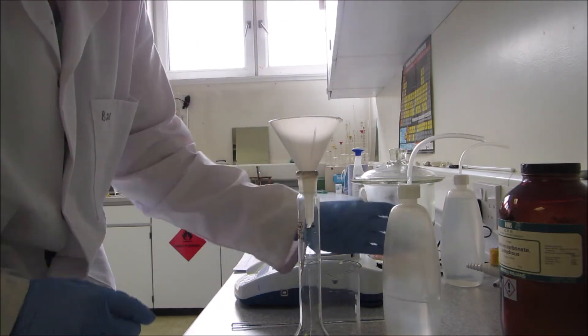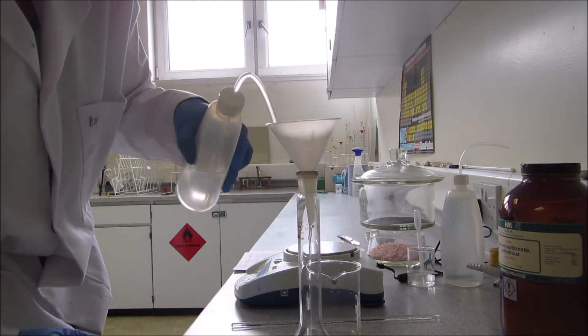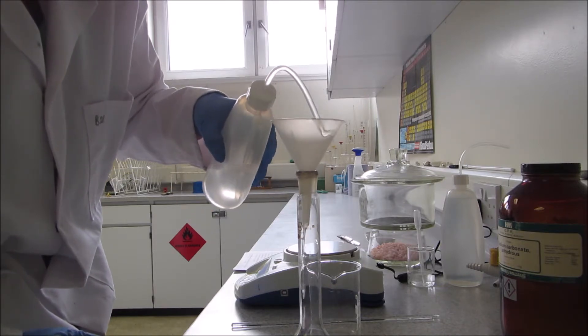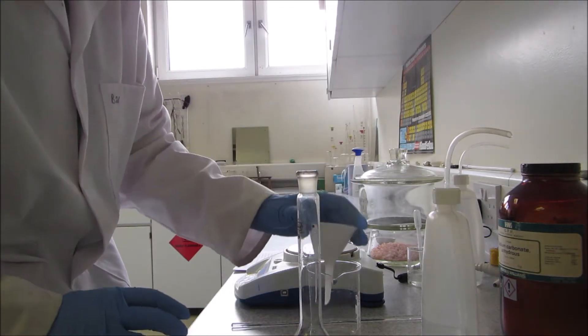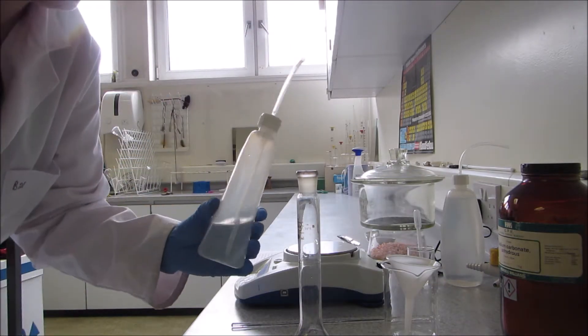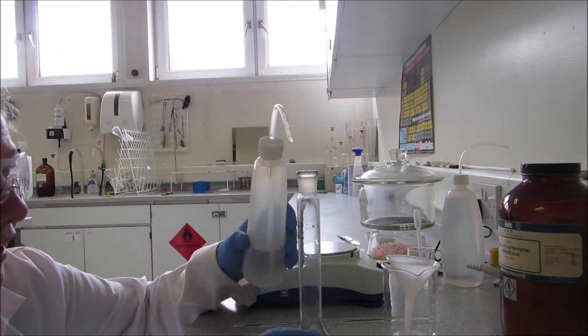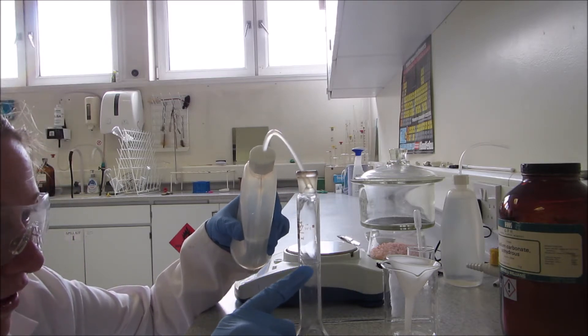And finally I'll just give a little swirl, rinse around those sides of the flask and funnel, and now I'm happy that that's got as much of my sodium carbonate solution into the volumetric flask as possible. Remove the funnel. So finally I'm going to fill this up with water to the darker mark.